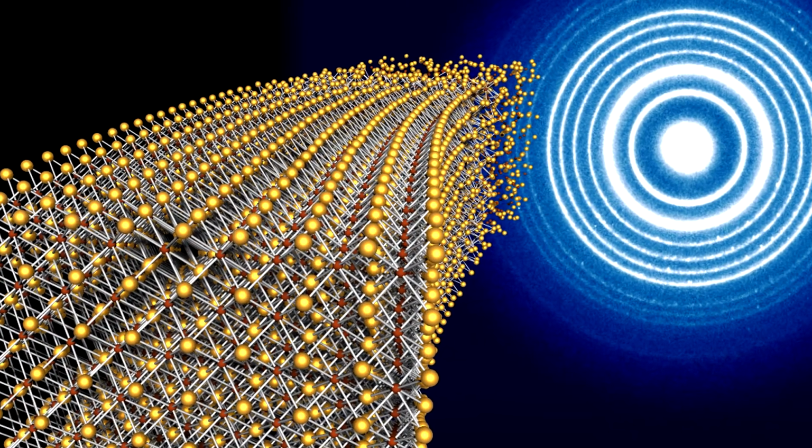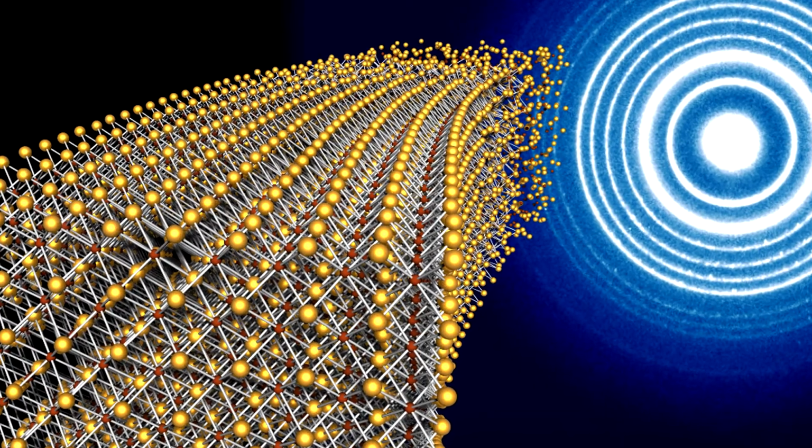X-ray scattering is an extremely powerful technique. So you see these interesting peaks or rings and patterns that come from diffraction and scattering events in your sample. What the user typically wants to know, what the scientist wants to know, is what is the real space structure. To go from the scattering pattern to the real space structure is quite complicated. To do it in practice, we develop a number of theoretical models that we use to fit the data.